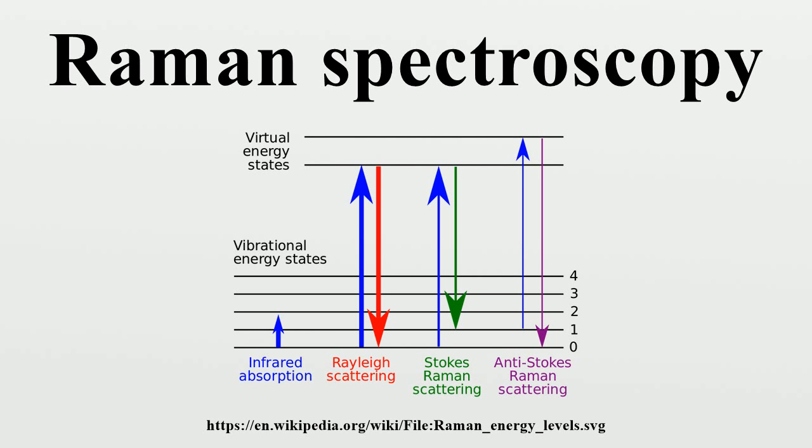The spectral information arising from this analysis gives insight into molecular orientation and vibrational symmetry. In essence, it allows the user to obtain valuable information relating to the molecular shape, for example, in synthetic chemistry or polymorph analysis. It is often used to understand macromolecular orientation in crystal lattices, liquid crystals or polymer samples. It is convenient in polarized Raman spectroscopy to describe the propagation and polarization directions using Porto's notation, described by and named after Brazilian physicist Sergio Pereira da Silva Porto.